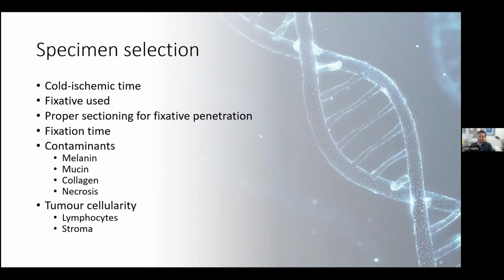Proper sectioning for fixative penetration. This is typically in larger specimens like a leiomyomatous uterus, for example. Fixation time was specifically an issue, I think, around the pandemic, where there were grossing delays, where specimens were spending too long in formalin.